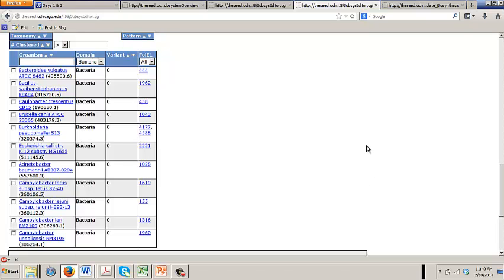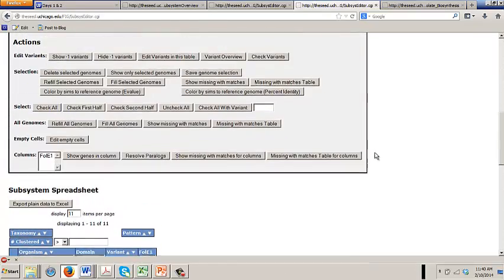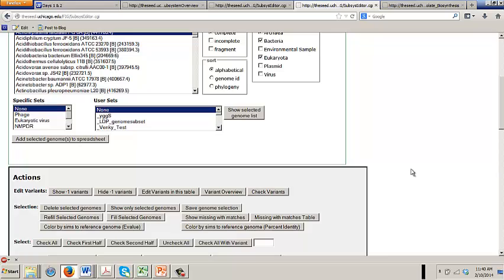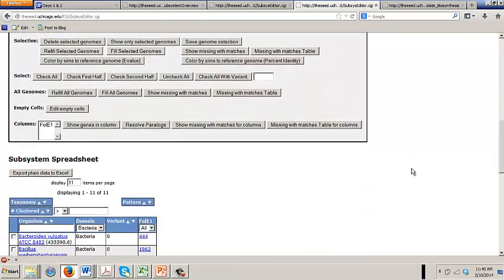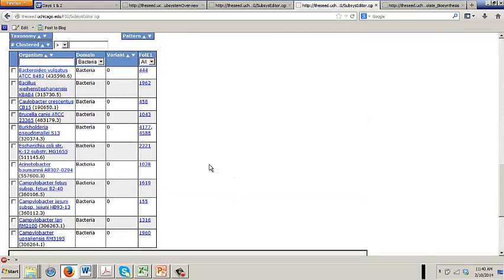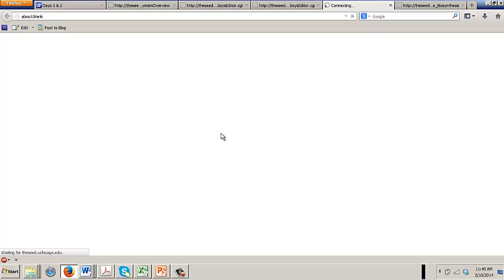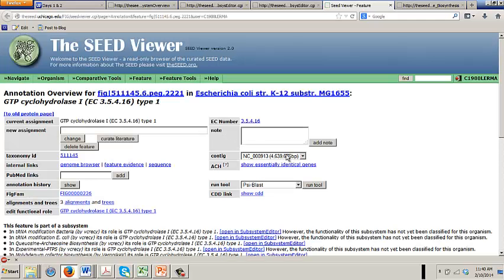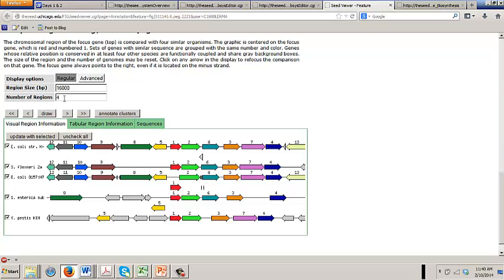We're now going to add interesting genes to the subsystem. To do that, I want you to go to the E. coli, click on the E. coli gene, and which one? Which E. coli? No, sorry. This already has 2. The 1655 is the one I was meaning, but I don't think it matters. Oh, it's fine. And then ask for 50 homologs.